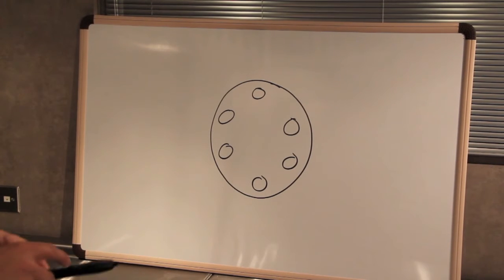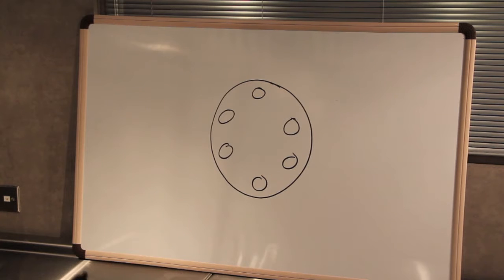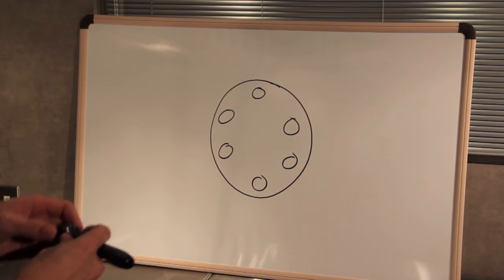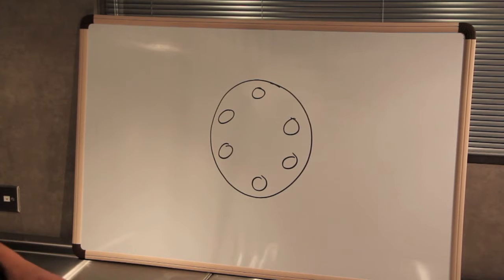Hello, this is Scott Kephart with Quasar Instruments and today I'm going to talk about how to plumb up an injection valve in an HPLC system.